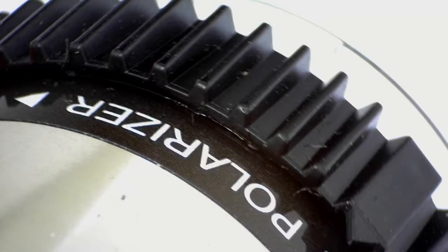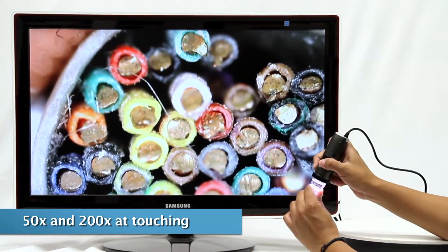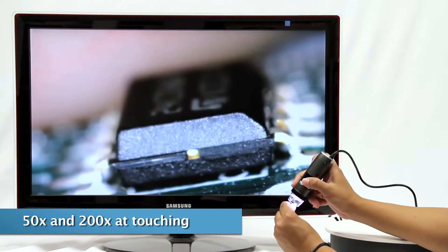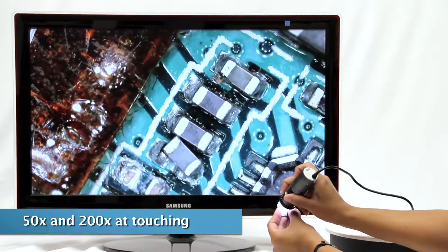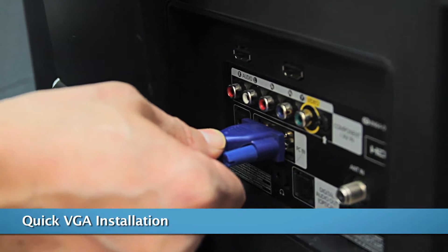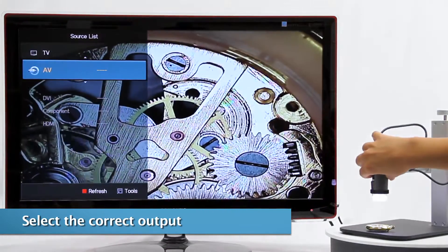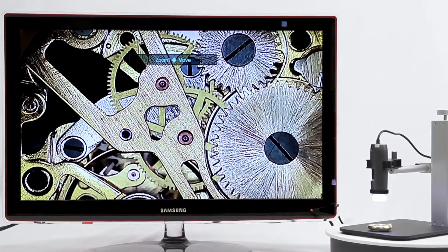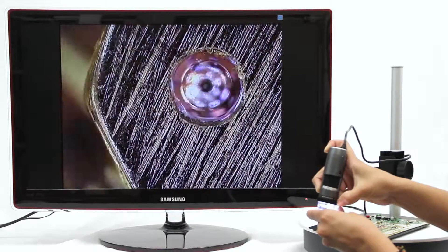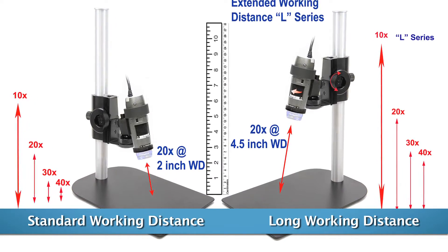Introducing the Dynolite AM5216ZT and AM5216ZTL high-definition microscope cameras, designed for the best real-time viewing with no delay. These are both 720p VGA models that connect directly to TVs or computer monitors with VGA ports. Select the VGA output and the video is live. These Dynolites can easily be used in a handheld capacity for viewing and inspection, or in a stand for additional stability and hands-free usage.